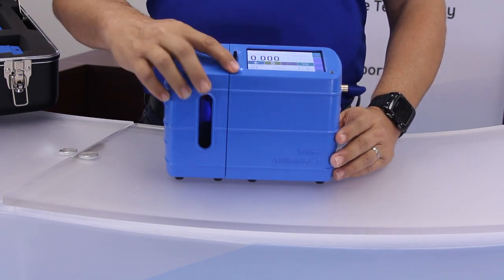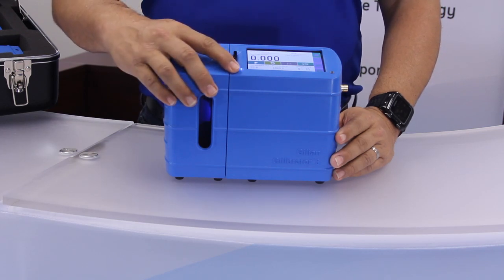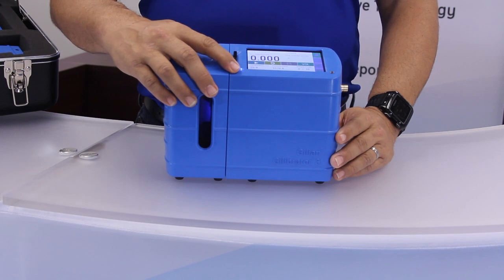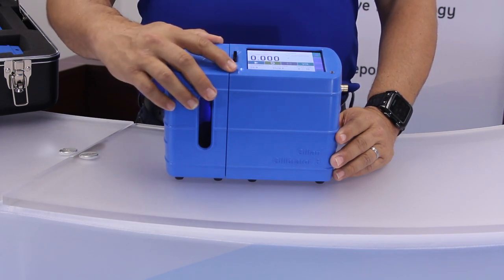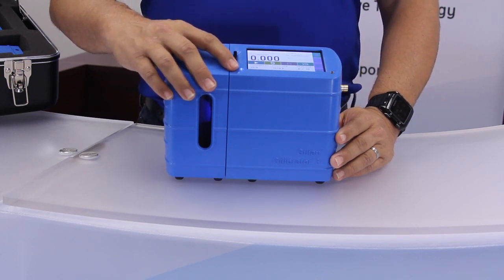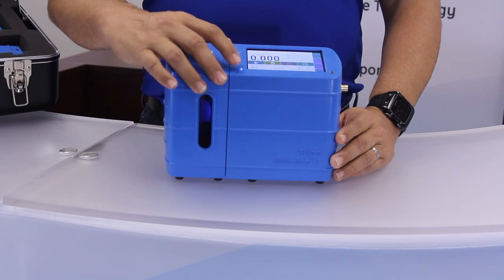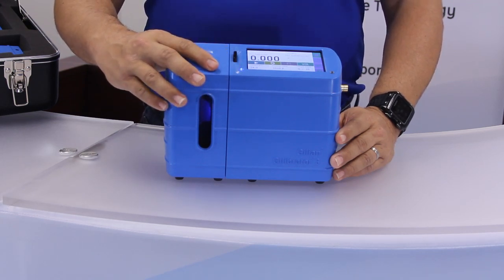The status notification LED, located adjacent to the lower left corner of the LCD display, will display the following status codes: solid blue means the Gilibrator is on; green means a firmware update is pending or in progress; flashing blue and red means you have an extremely low battery, and the Gilibrator 3 will shut itself off at this point.